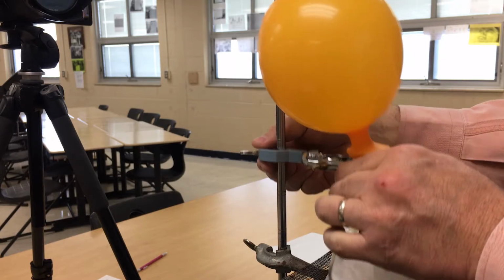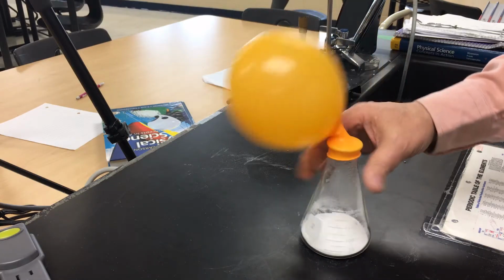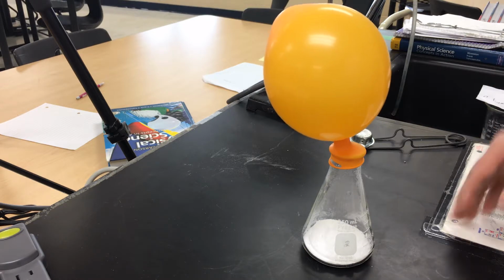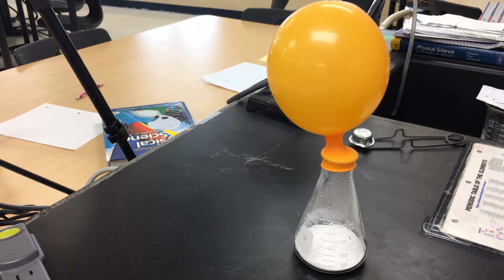Okay, it's cooled down enough I can handle it a little bit. So I'm going to take it off the ring stand and set it on the lab table, and that will hasten the cooling off process. Even with the flame having been off for about 3 minutes, there's still enough heat in the system to have some of the carbon dioxide continue to decompose out, and a good bit of water has also decomposed out of the sodium bicarbonate.